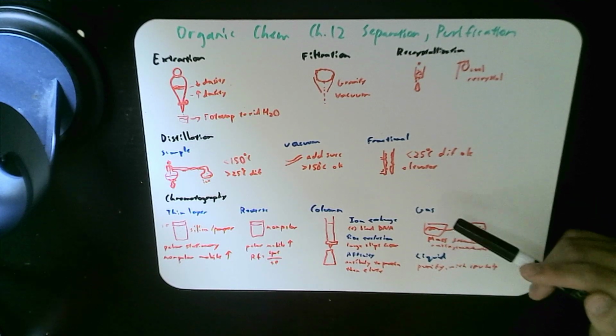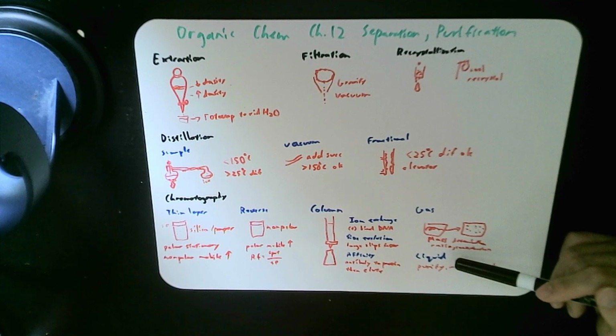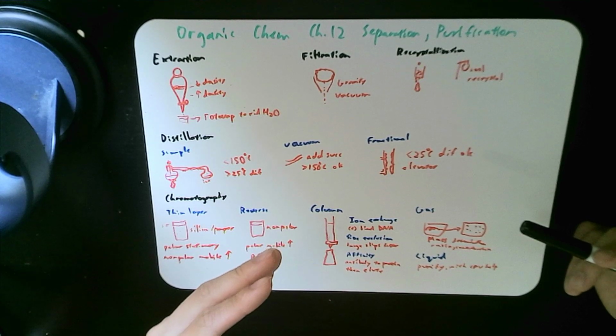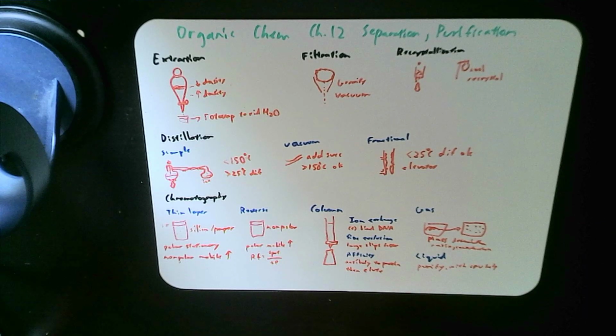Liquid chromatography acts similar to gas. Basically, same thing, you purify by using a pressurized liquid, and with the help of a computer, designate a stronger pressure to guide where you want the molecules to go. That's pretty much it for the separation and purification.